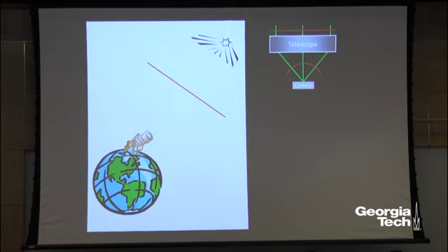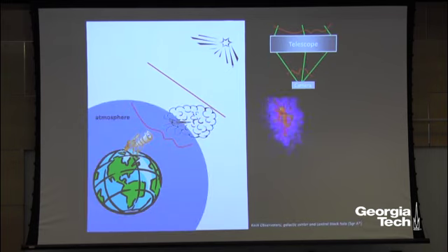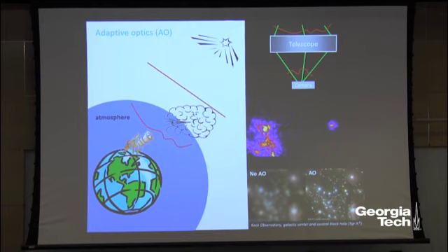So ideally, you want the starlight to be focused nicely into a focal spot onto your detection camera. But before that could happen, your light has to pass through the atmosphere, which distorts the light, just like the biological sample distorts the excitation light. Instead of a very sharp image of the star, you have something that is very fuzzy. But if you can similarly measure the aberration of the distorted light, then you could correct it, and you will have a much sharper image of the same star.